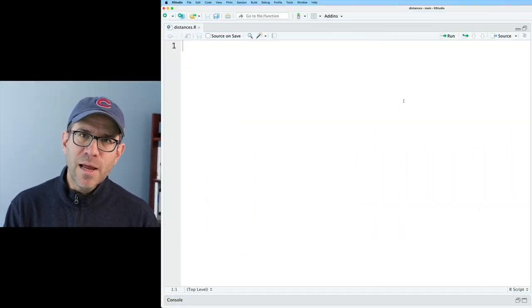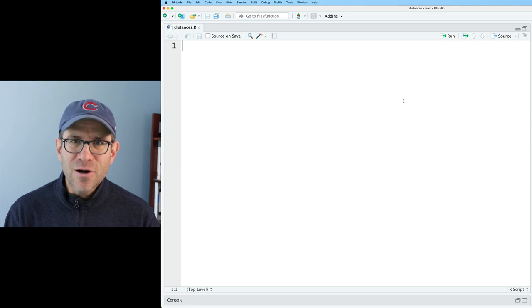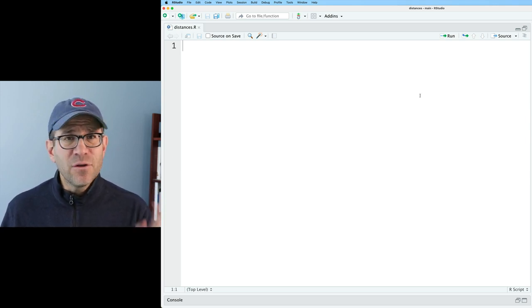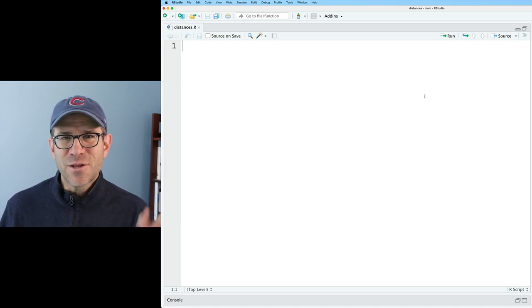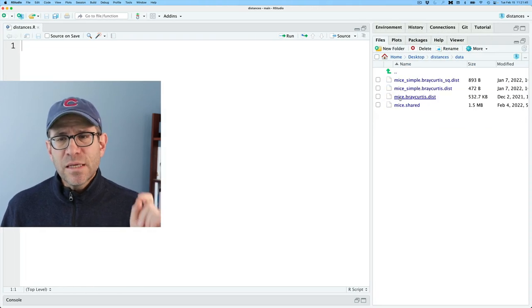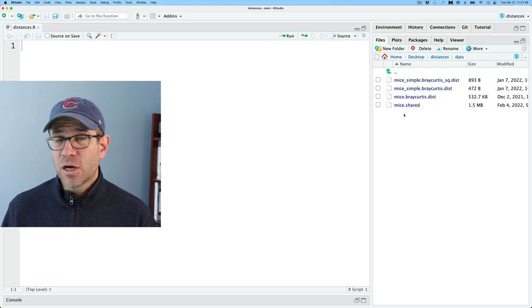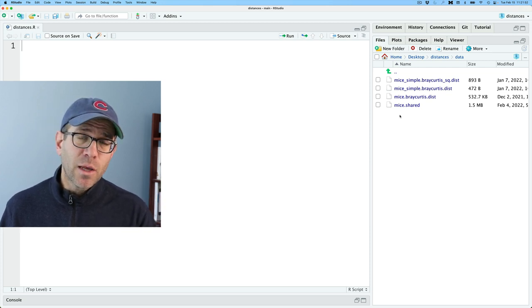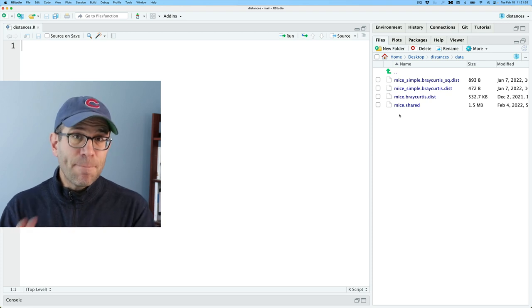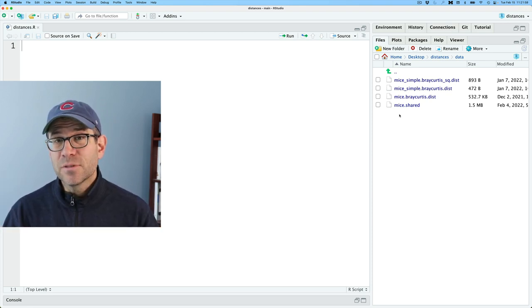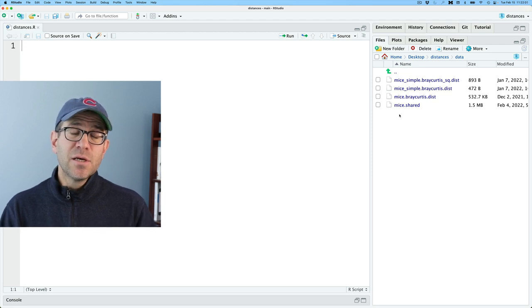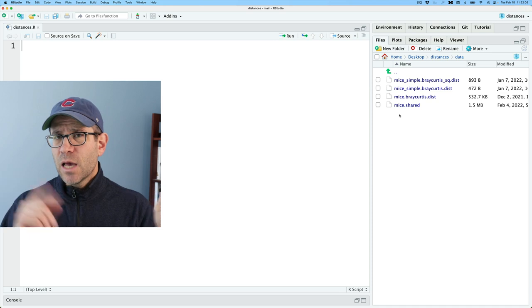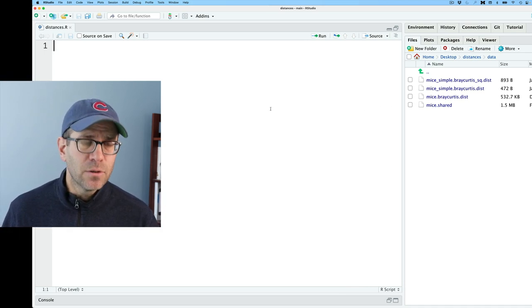I'm over in RStudio now, and I've got my blank R script ready to go. I'm calling it distances.r. Something that you should know is that if you'd like to follow along, you can go down below into the description and there's a link to a blog post. Something that's important that I added was in the data directory, you'll notice that there's a new file called mice.shared. Something that's important to recognize in that file is that not all of the samples have the same number of sequences.